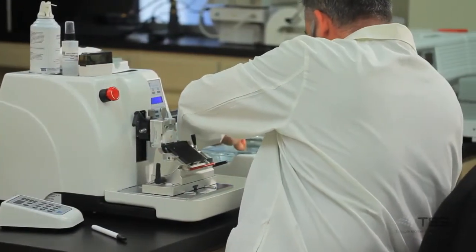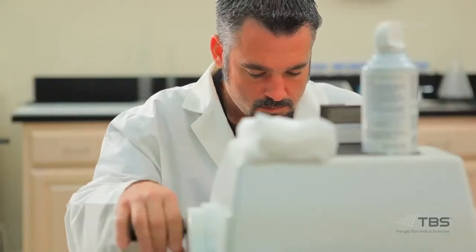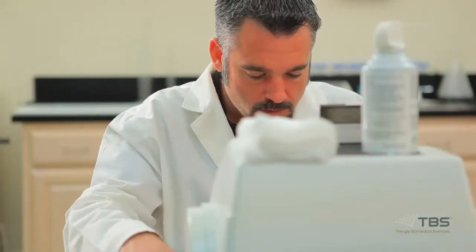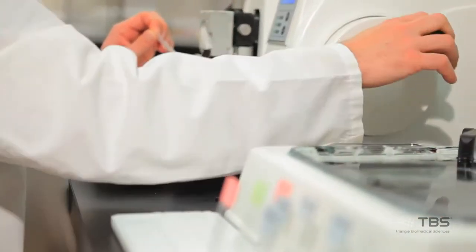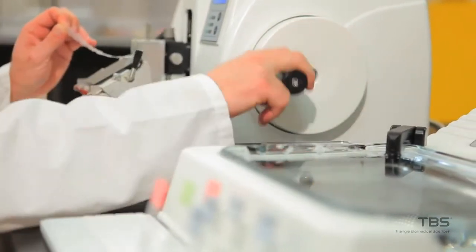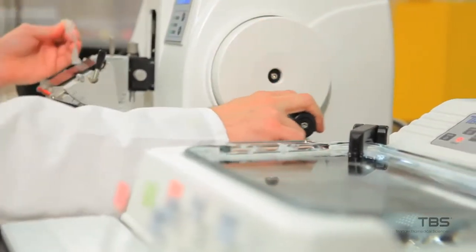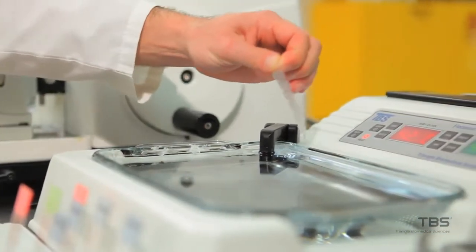The SC2500 is an introductory unit designed for the cost-conscious user. It has the same motorized trimming and sectioning thickness setting features as the more advanced 3500 and 4500 models, but does not include the added benefits of the specimen arm position memory feature and the ergonomic handpad controller.